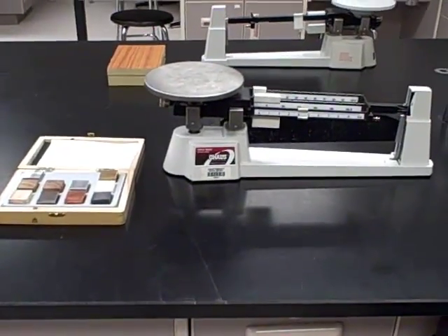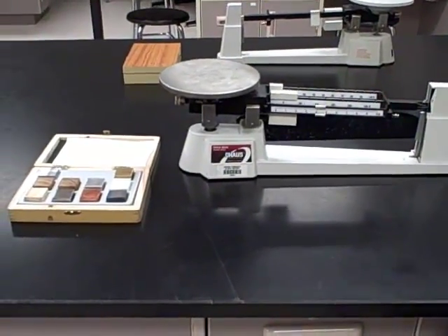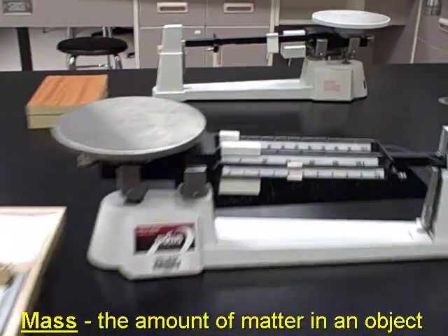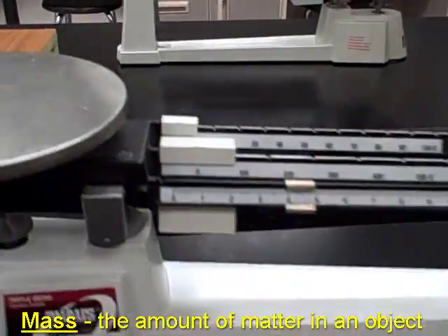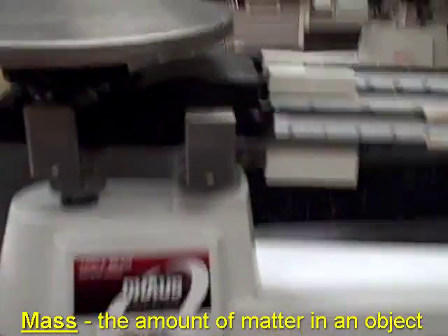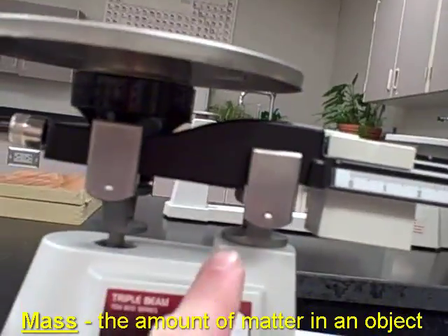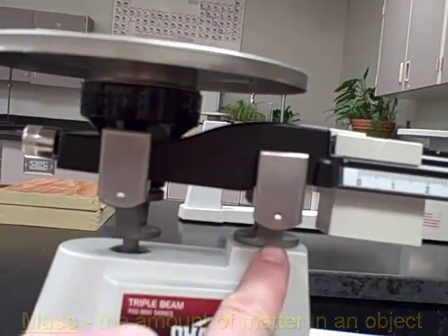Alright, here's a quick tutorial on how to use a triple beam balance to measure mass. It's called a triple beam balance because you're actually going to balance something around this pivot point right here.